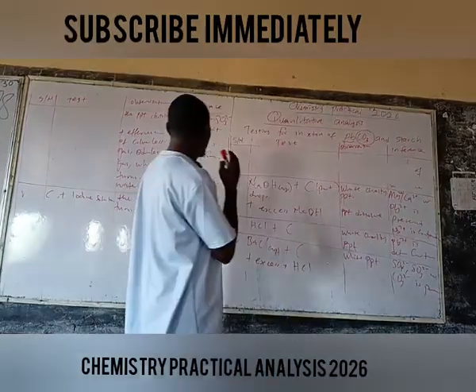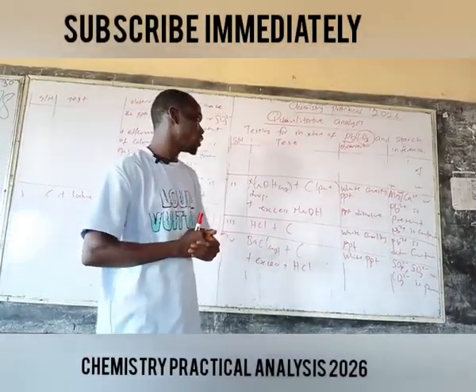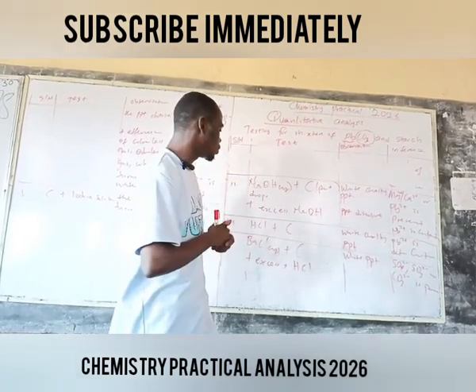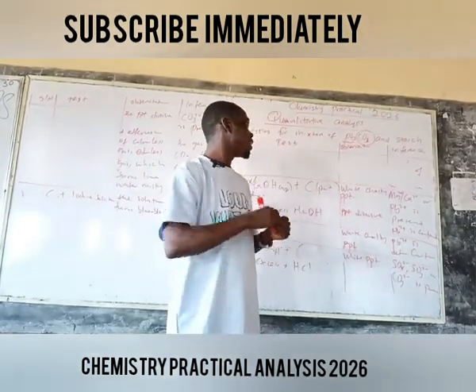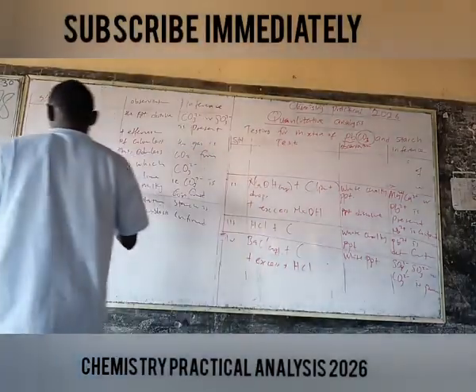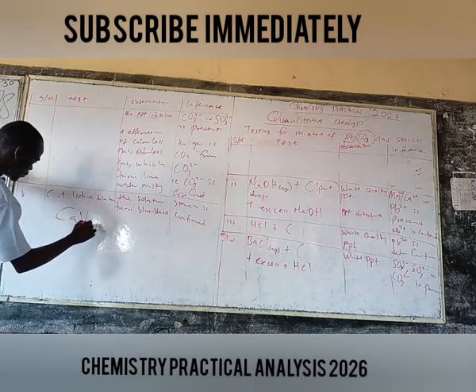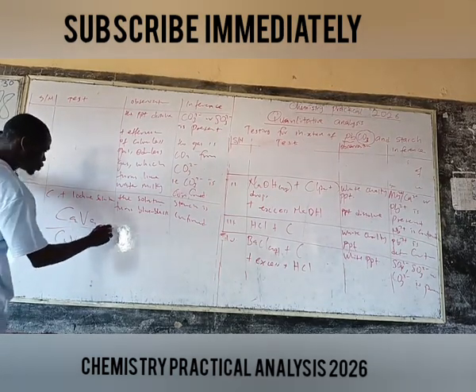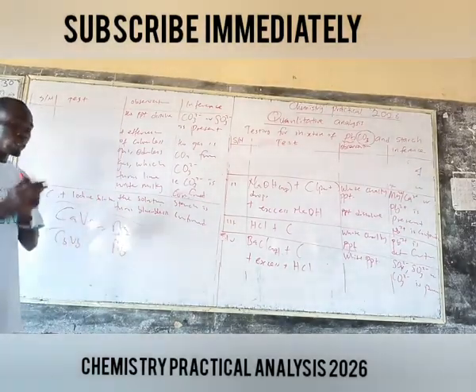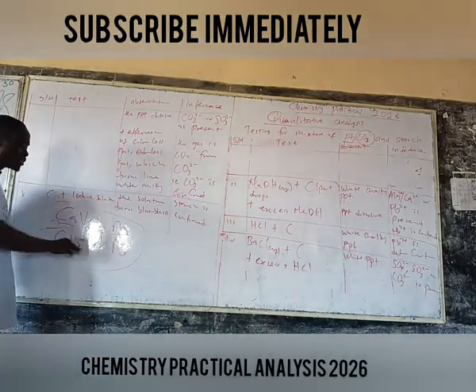The basis of the major issue in this practical is qualitative and quantitative analysis. The quantitative analysis requires you to be serious and go through your past questions, see how questions are asked, and learn the basic principle. You should remember this basic formula: CA VA over CB VB is equal to NA over NB. Whenever you use this formula in your WAEC exam, please don't forget to define your symbols. Don't assume they should know the symbols. Before you write this, make sure you define your symbols.